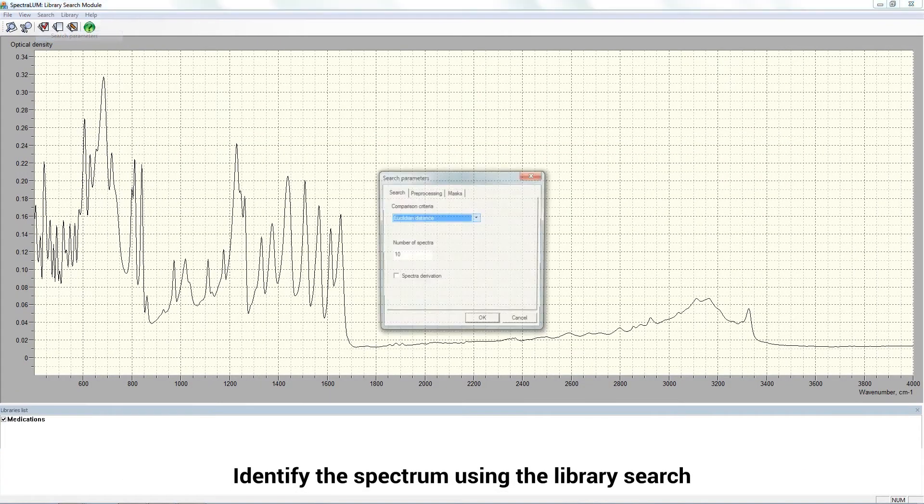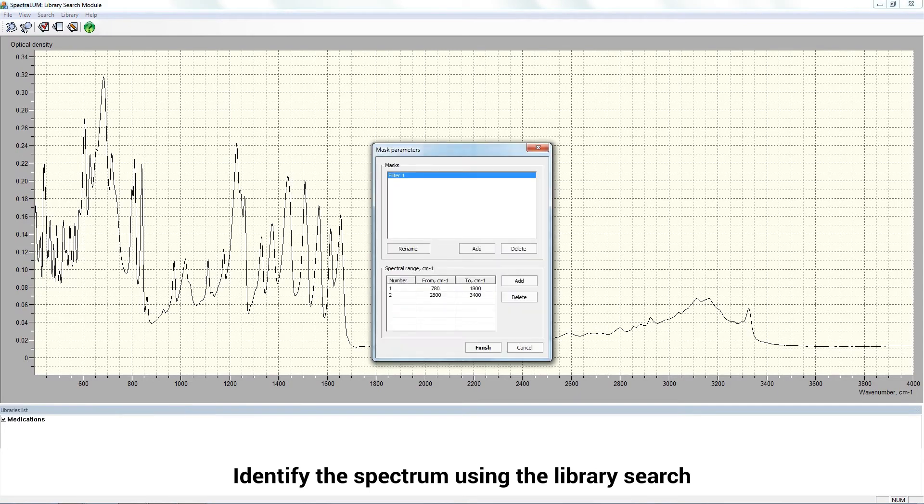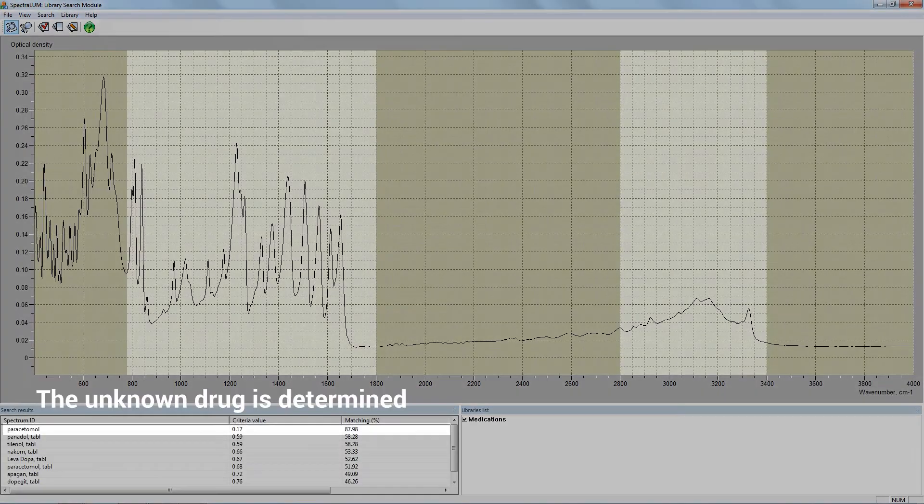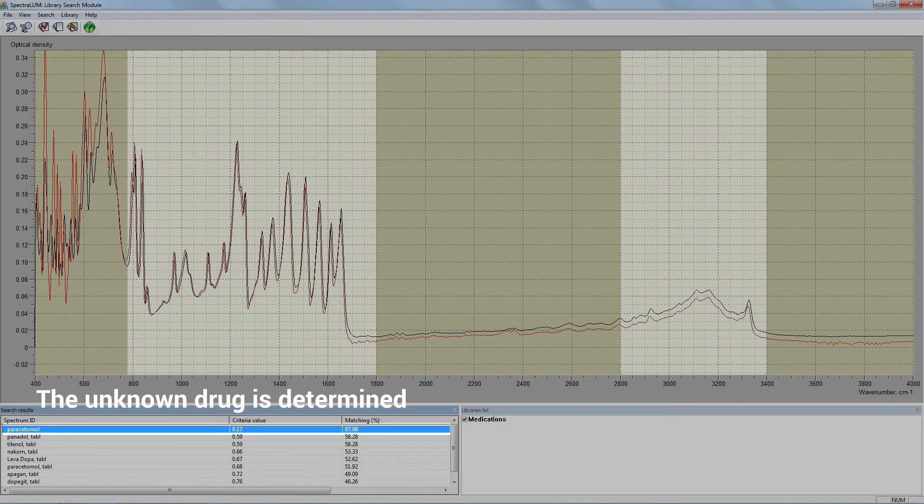The obtained spectrum can be identified using the library of drug spectra. Now, the identification process is complete.